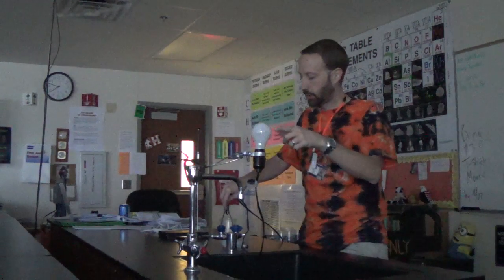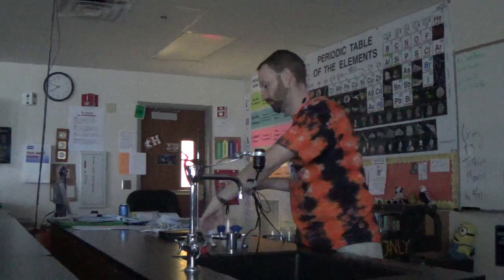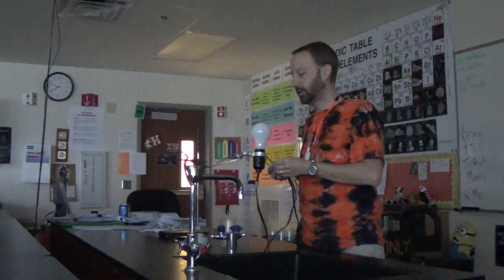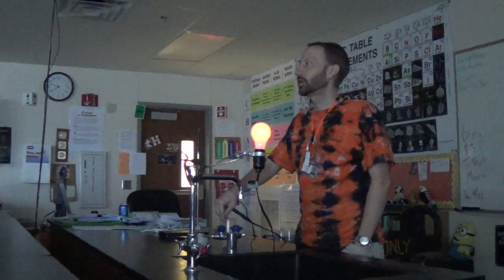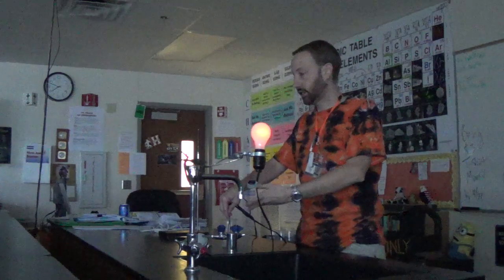This is the 100-watt bulb. What do you notice? Nothing. Okay. So let's try the 34-watt bulb. And I remind you that it is on. Weak. So what kind of base would we classify ammonia? Weak base. And that's exactly how, in like 4 more days when we talk about acids and bases, we will say it's a weak base because it does not ionize well. It obviously is dissolved, has to be a base, but doesn't ionize well.